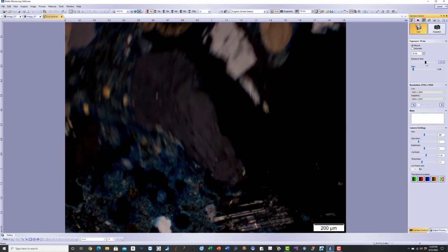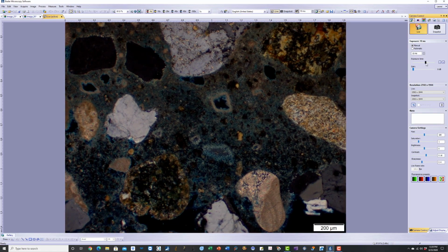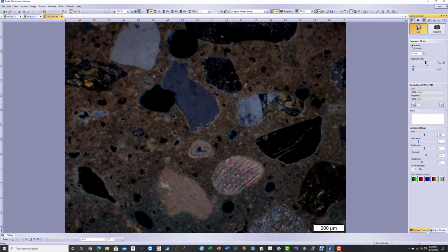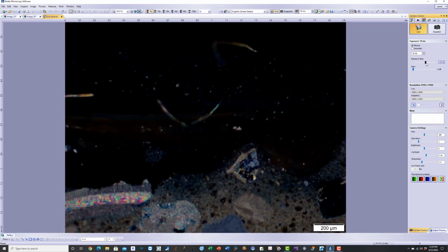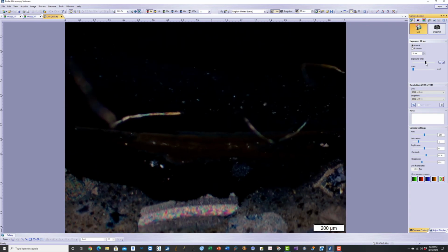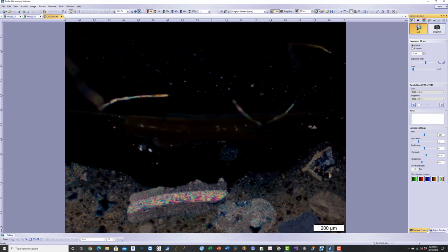Carbonated Portland cement paste of the mortar coating. Then comes at the top the denser part of the mortar coating, and after the denser part of the mortar coating comes the very top sand, a very top acrylic layer.